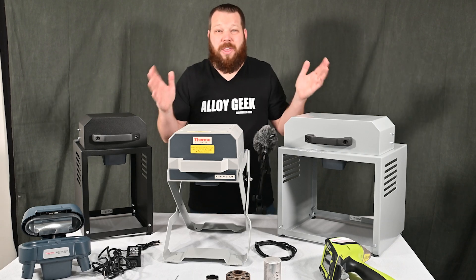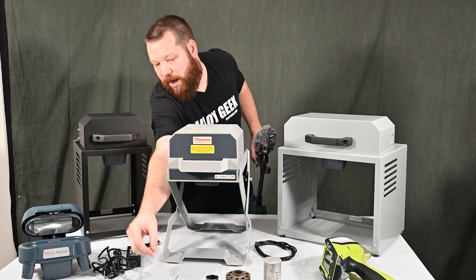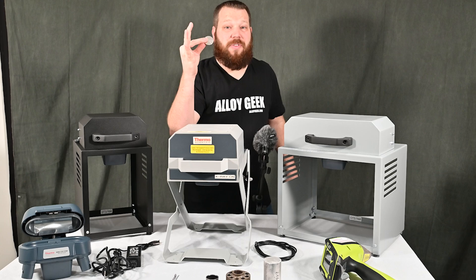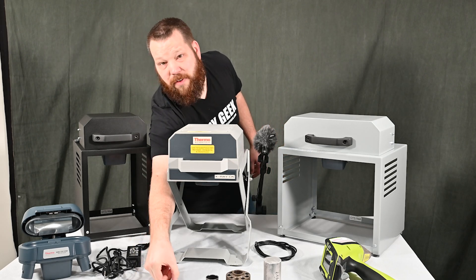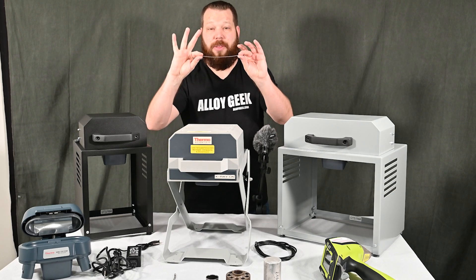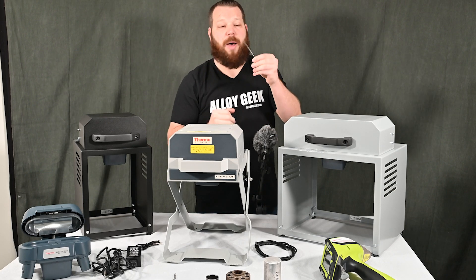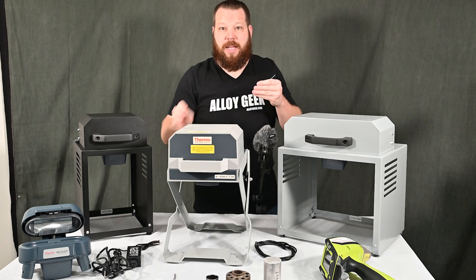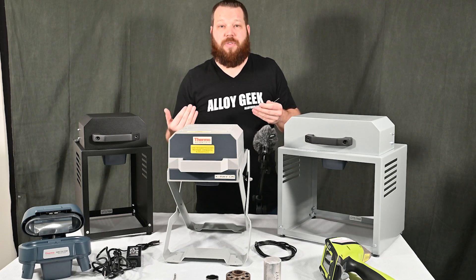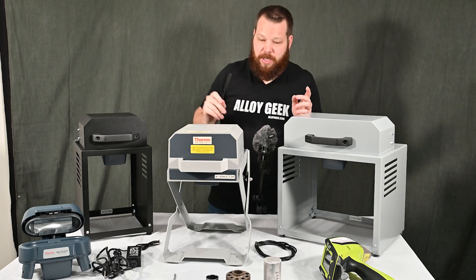First we need to talk about why you would use a test stand. The first thing is small samples — I have some samples here like this dinky little spring, or sample coupons if you're getting coupons from your supplier that you need to verify, or from your own facility. That's an easy way to do it — run them in a test stand. Another thing: weld wire. When we shoot x-rays up around weld wire on a tabletop surface, we get scattered x-rays from the tabletop back into our results, and we don't want that. A test stand eliminates that a hundred percent.